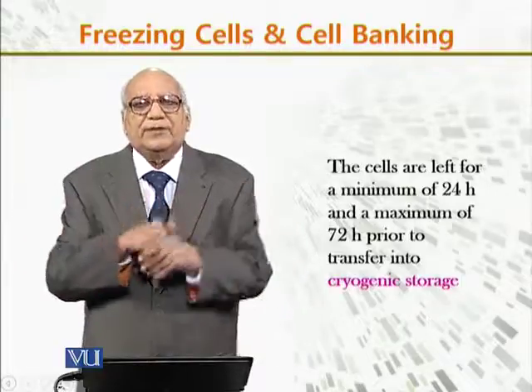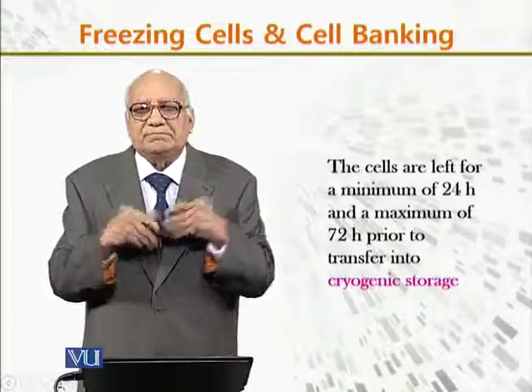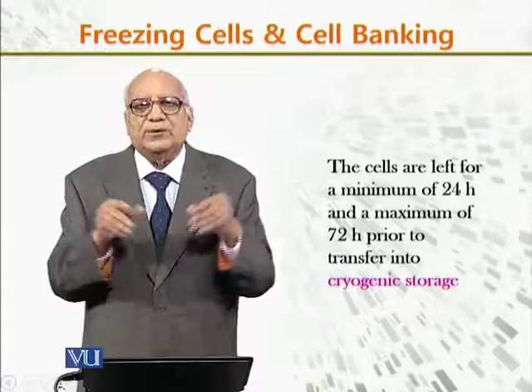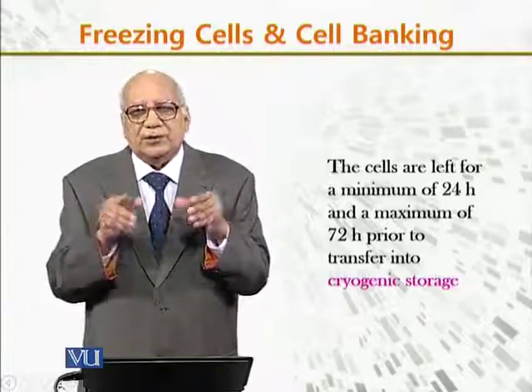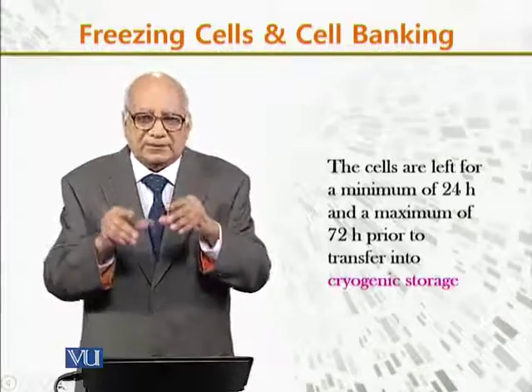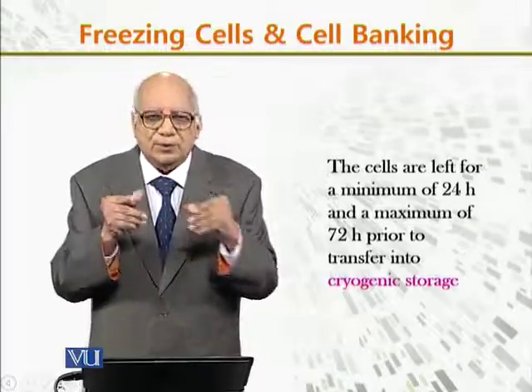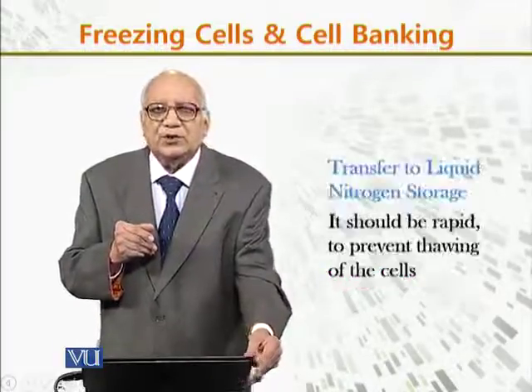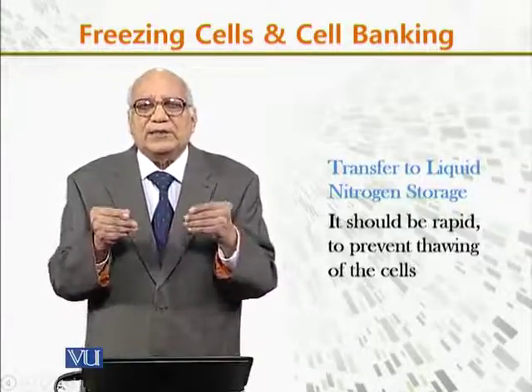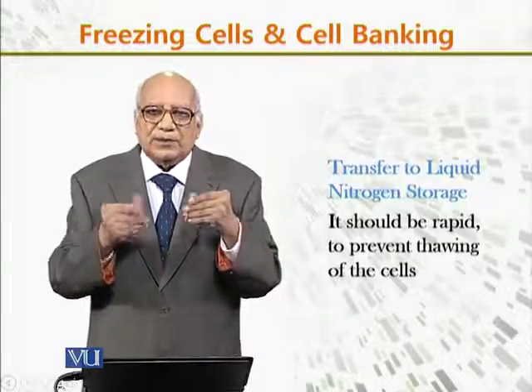The cells are left for a minimum of 24 hours and up to 72 hours prior to transfer into a cryogenic state. So you see, we first make them freeze, and then we transfer them to a cryogenic store, a liquid nitrogen storage, which is very low temperature.